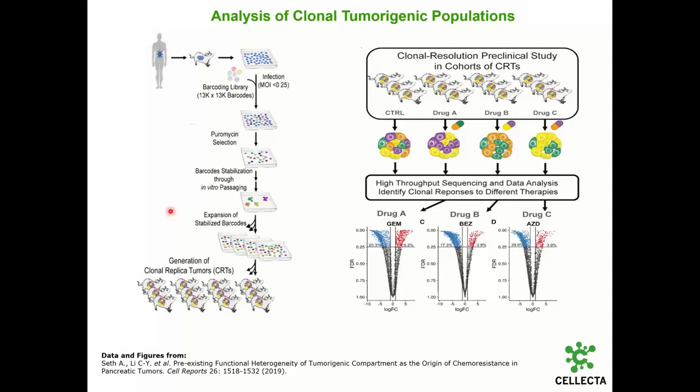or other selections. Also, on a single cell level with a single cell platform such as the 10X system, genomic barcodes in the cell can be correlated with the activity of particular genes or changes in specific expression profiles, and grouped then by subpopulations or sets of founder cells.